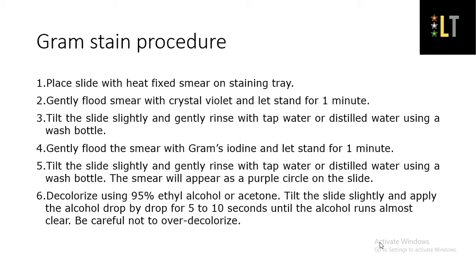Tilt the slide slightly and gently rinse them with tap water or distilled water using a wash bottle. Then gently flood the smear with gram iodine solution and let it stand for 1 minute.